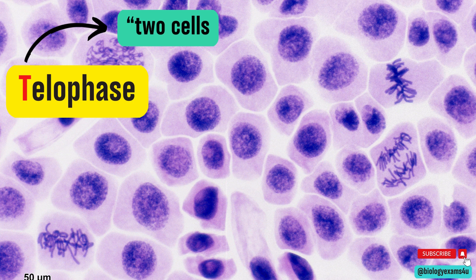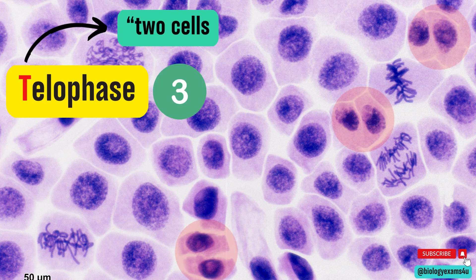So this one — here we can see chromosomes clumped together at two poles. The size of the cell is small compared to the size of the cell at interphase. This is the first one. Then this is the second one and this is the third one. So there are three cells in telophase.